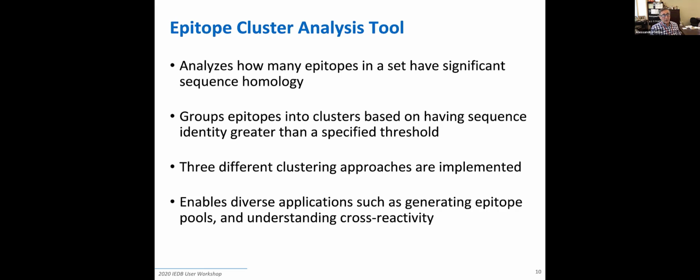Say that you have a series of results from different labs, and of course, different labs may synthesize different frame shifts of an epitope, or it is commonly also encountered in the case of eluted ligands, where you have essentially the same or similar related sequences, but they're not exactly in frame, or they may be slightly longer or shorter.